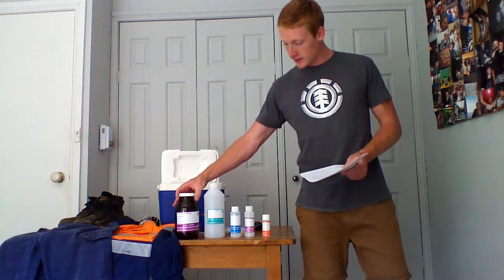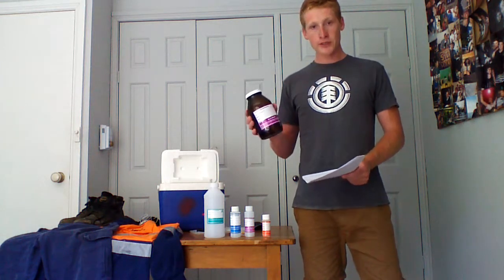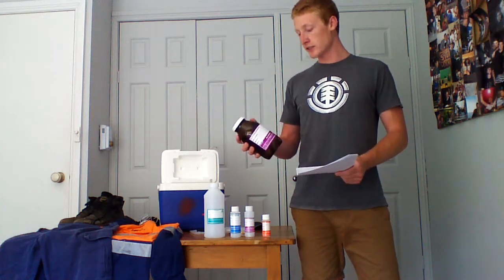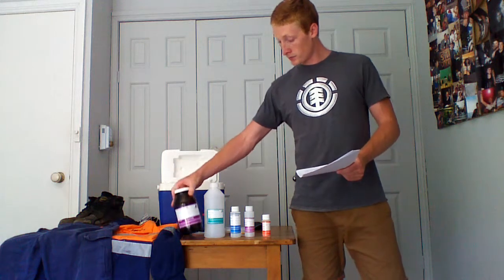The type of container is also important, choosing plastic or glass, and acid washed or solvent washed is necessary to reduce a loss of target analyte and prevent organics such as hydrocarbons remaining on the sides of the container. So for example, you can see this glass jar as an alternate to plastic for the sample of oil and grease, and prevents the analyte sticking to the sides of the bottle at the analysis at the laboratory.